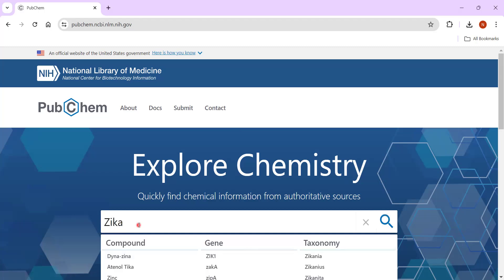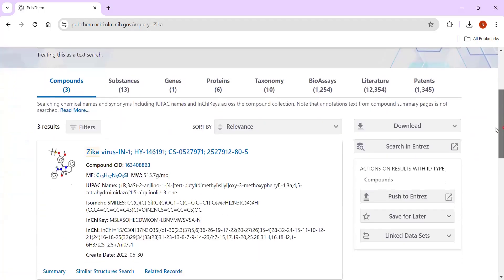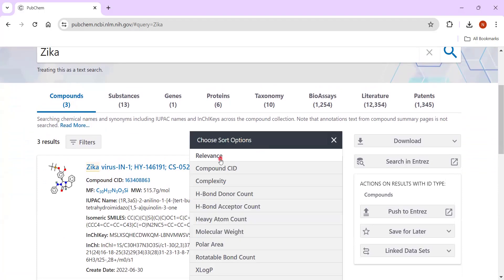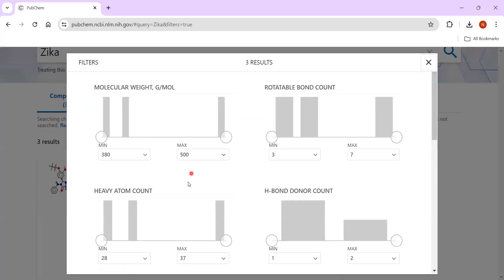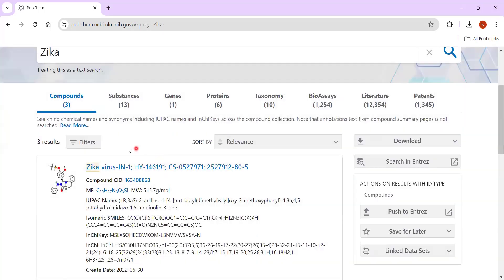I will just search for 'Zika' and you can see that it's providing three compounds. Whenever you get a large compound list, you can filter it. There are different filters based on Lipinski properties and more. If you get a huge list of molecules, you can filter out based on different drug properties to get your filtered drugs. If you're getting a very specific small list like 10 or 20, you can still use this same process to download the drug data.